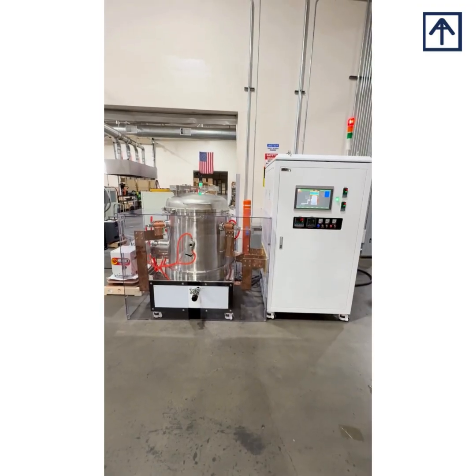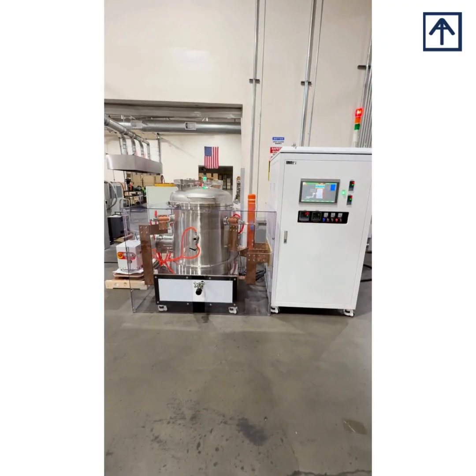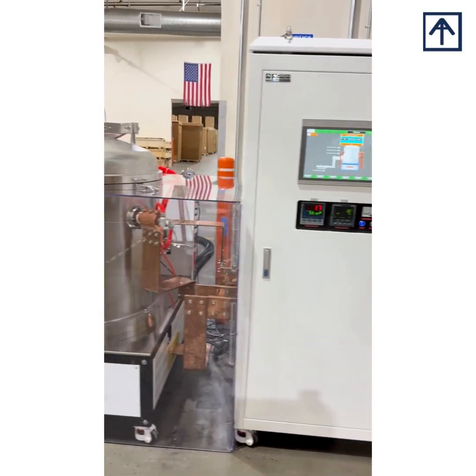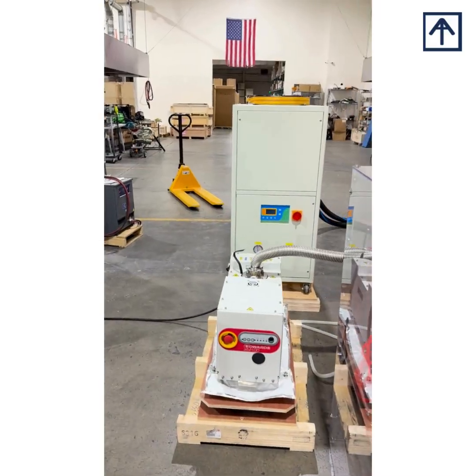In this session, we are going to explore the furnace features, applications, and how it can help you achieve optimal results. As you can see, the unit consists of 4 parts: the electrical chamber, the vacuum chamber, the vacuum pump, and the chiller for the insulation jacket.